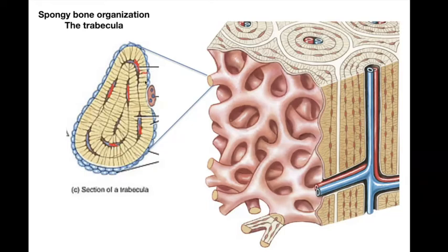All these canaliculi can connect with each other, and they can also connect to the outside over here, where there's going to be a lot of blood vessels and stuff like that. And then that could get through the canaliculi to the cells. In the case of the osteon, the canaliculi can reach over here to this blood supply or to the outside bone part. They're going to be connected to some kind of blood source where they can get the blood filtrate.